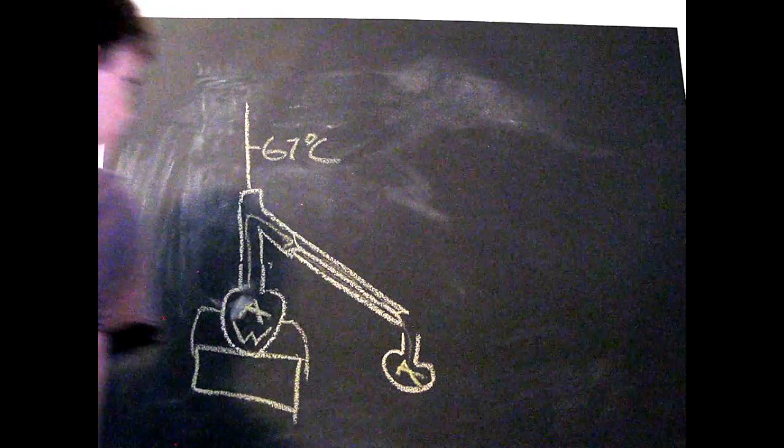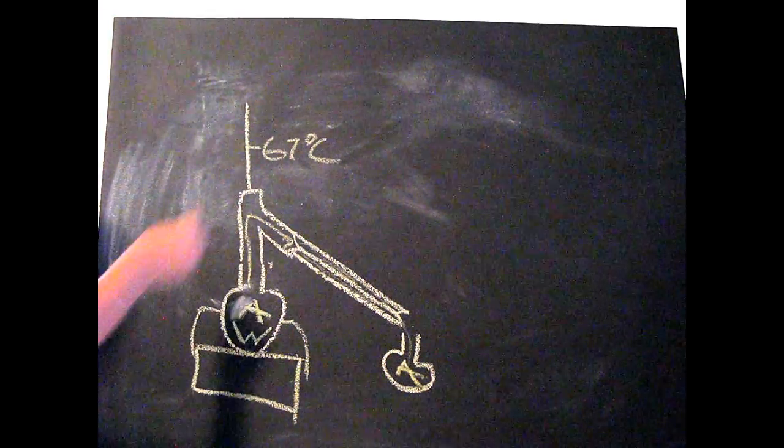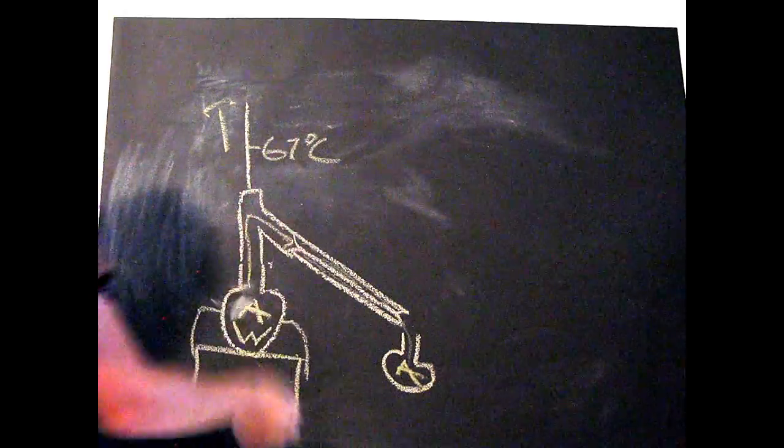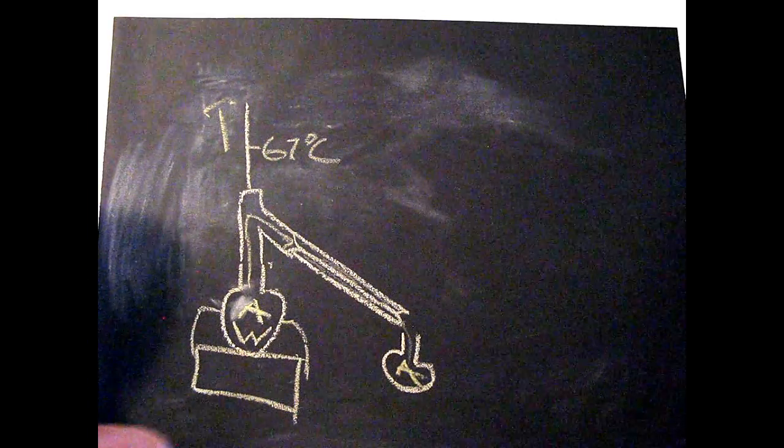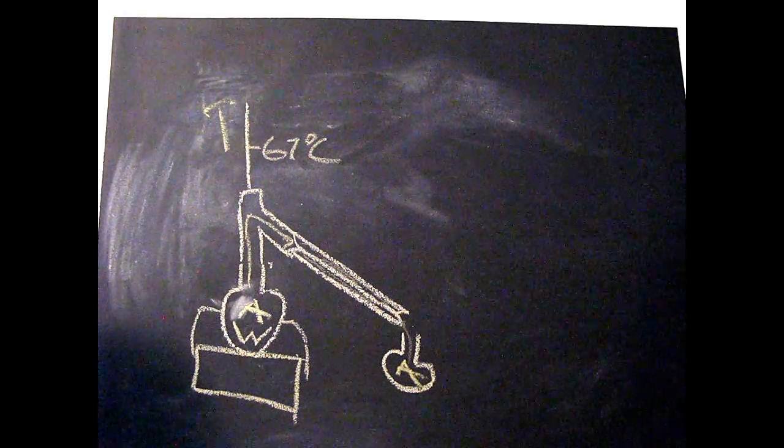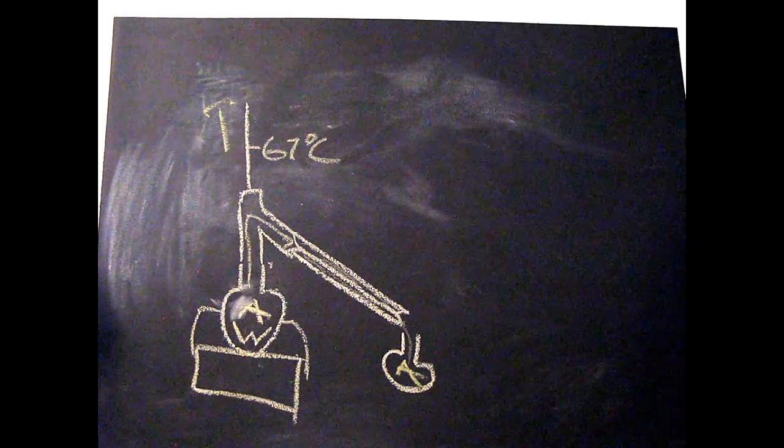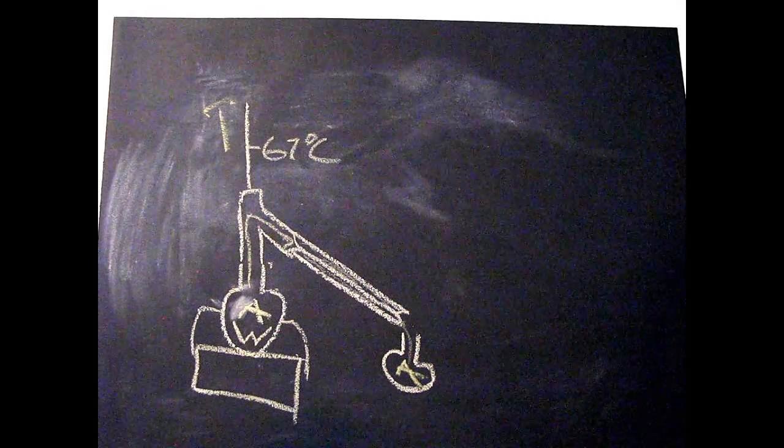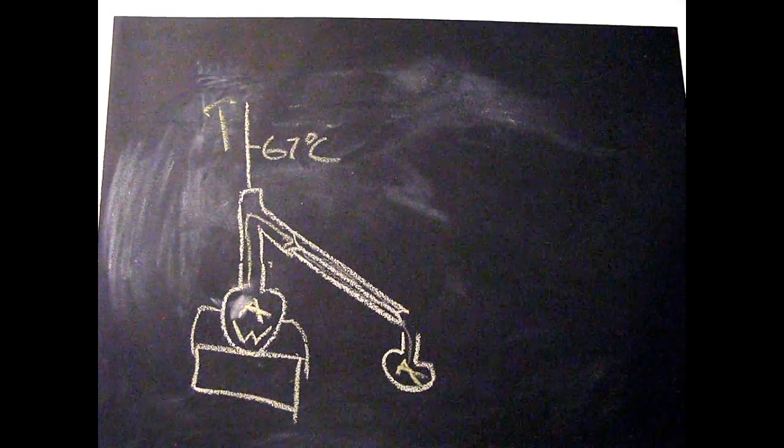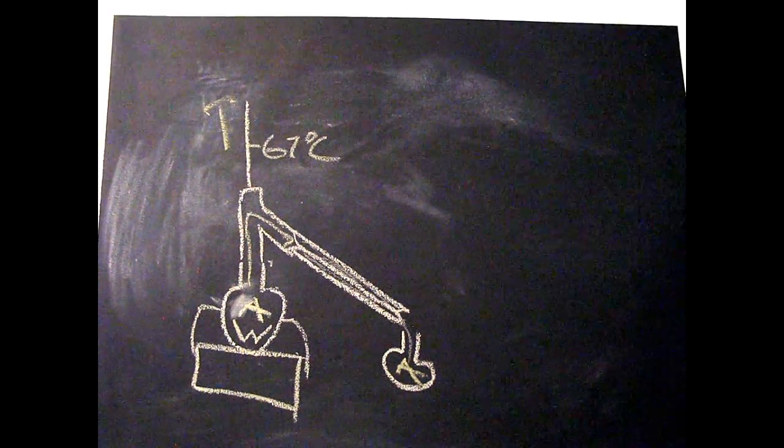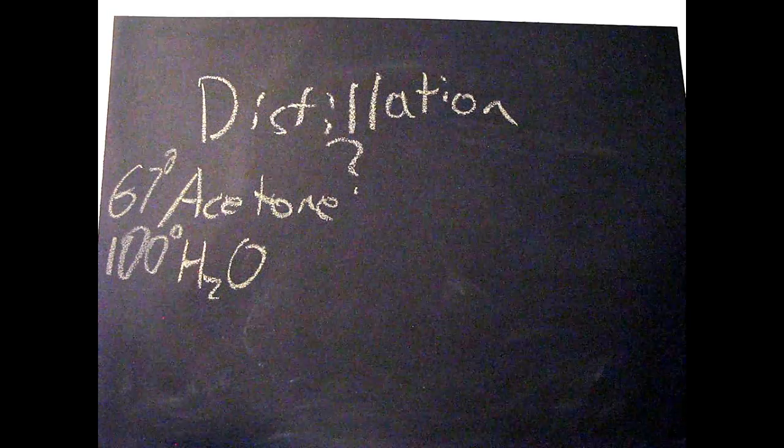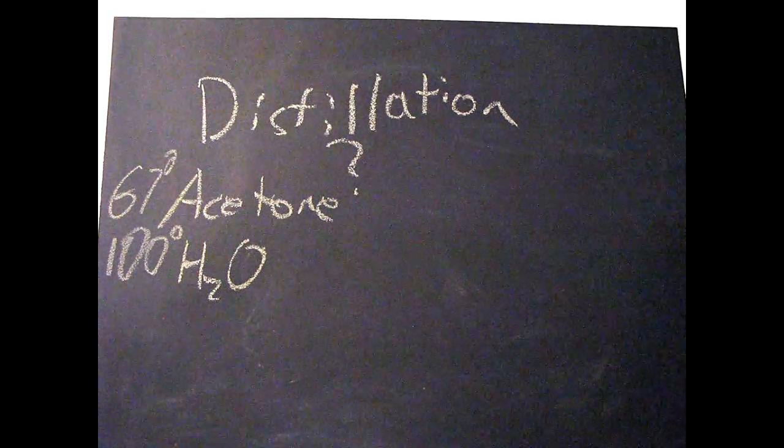So then you just have the acetone over here. And once the temperature starts to rise, you're going to want to stop your distillation and then over in your receiving flask, you'll have pretty highly pure acetone or whatever other liquid you're distilling. Now over to how to set a distillation apparatus up.